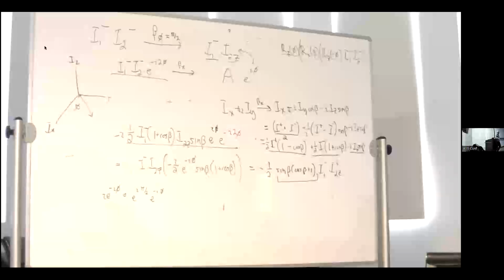Of course, sometimes you prune, you get the main signal, and then you see there are artifacts in the spectra. And that means that some operator that you thought was never going to turn into observable signal turned into observable signal because pulses aren't exactly 180-degree pulses, etc. Then you have to try to figure out which term gives the artifact. But if you're reading a paper and somebody presents a pulse sequence and you want to work out how the pulse sequence works, pruning is an important part of simplifying your life.